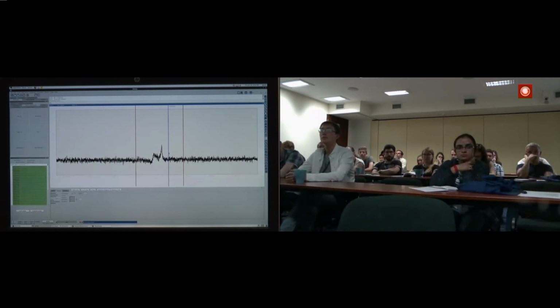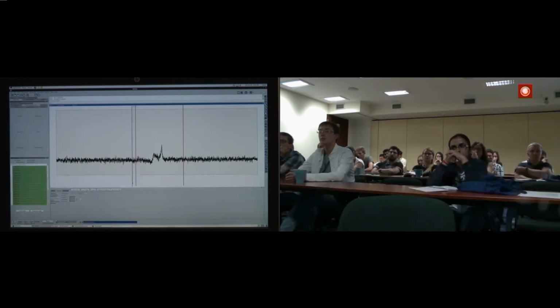Okay, so as you can see, even for the static solid state sample, we can somehow recognize that there are probably two signals over here. However, the quality of the spectrum isn't satisfactory at all. So we would like to somehow improve it, to at least make it more high resolution, let's say.